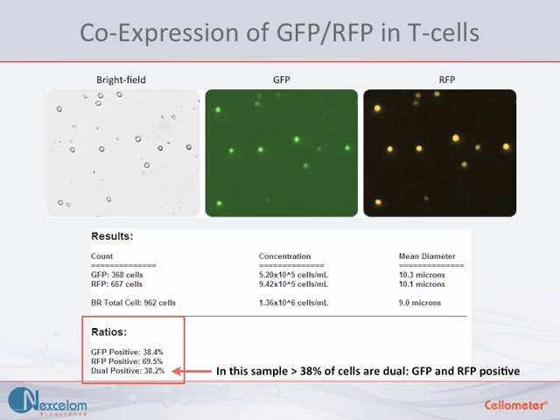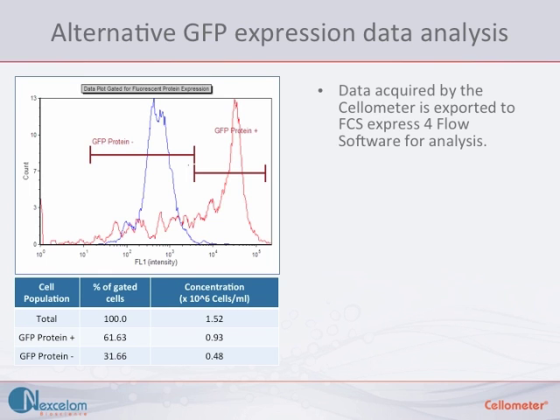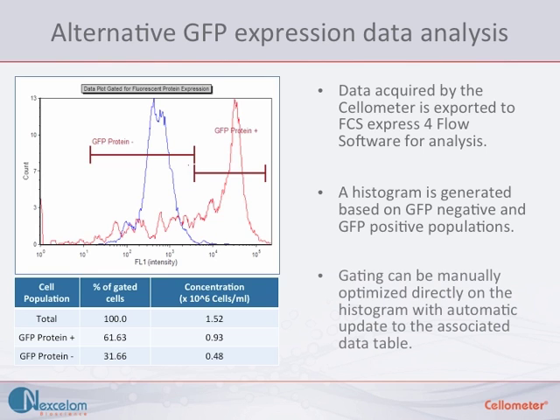Alternatively, we can also measure GFP expression by looking at the total fluorescence intensity of a sample and export it to software that is typically used for flow cytometry. The data from the Cellometer images are exported to FCS Express software and a histogram is generated. The histogram displays the GFP negative as well as the GFP positive populations. Gating can be manually adjusted and the corresponding data is automatically updated.